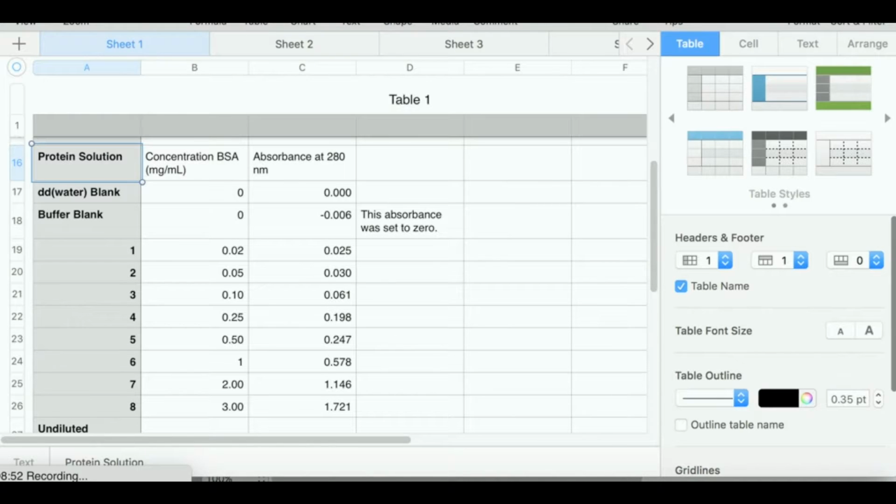So you use the dilution equation from a stock solution to get these concentrations. And you're going to have different containers with a solution of each of these concentrations. So if I had 8 solutions here, I'd have to have 8 different containers to hold each of these, okay?